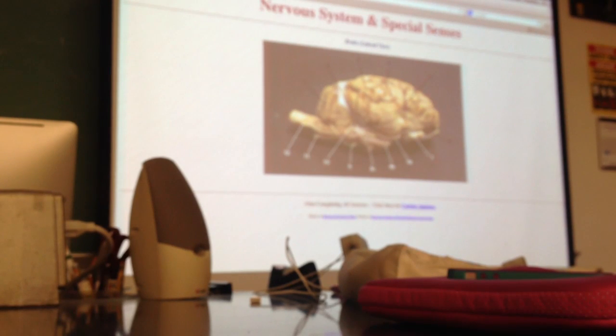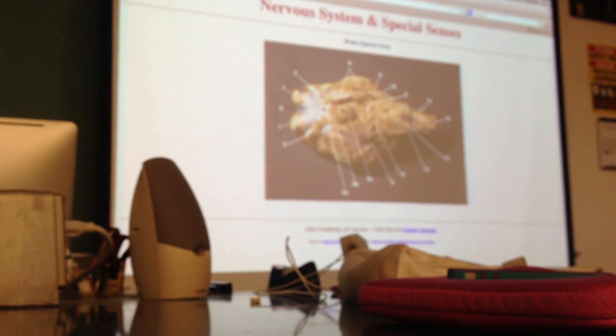Most of the optic nerves on our sheep are going to be cut, so I'll switch to the inferior view so you can see what that would be like. Just to reorient you, here's the front of the brain, or the anterior portion with the frontal lobes, and these two big white spots would be our olfactory bulbs. And then right here, we'd have our optic nerve.